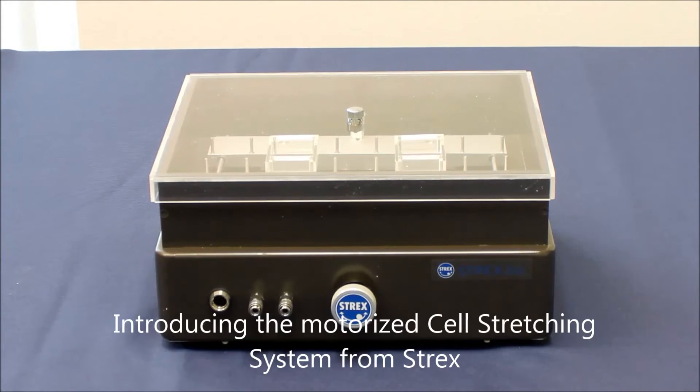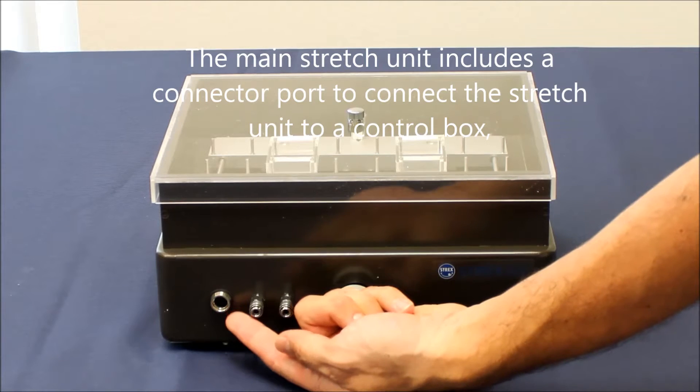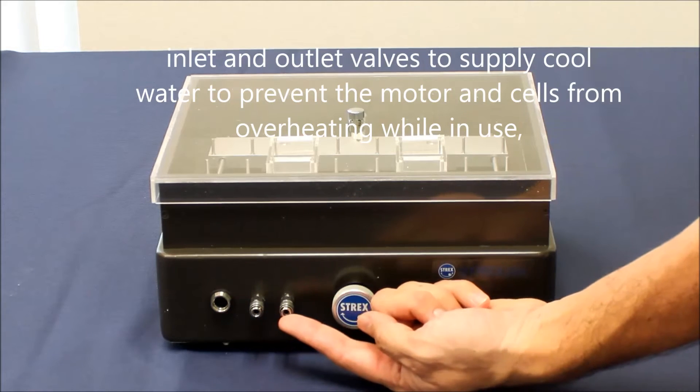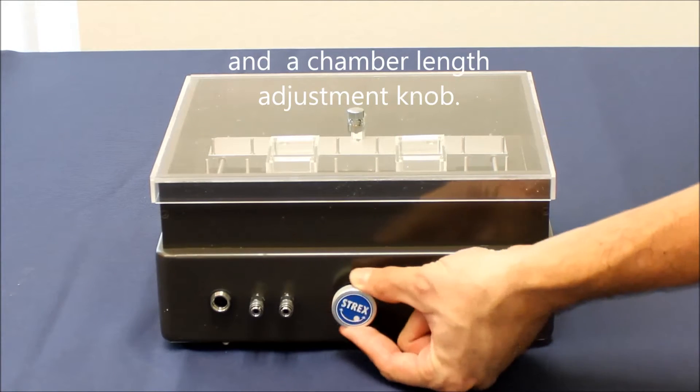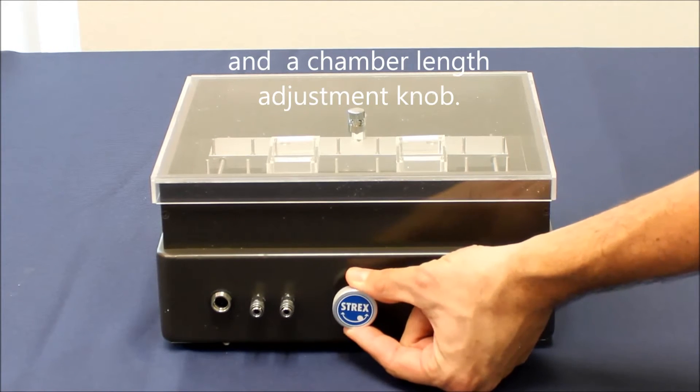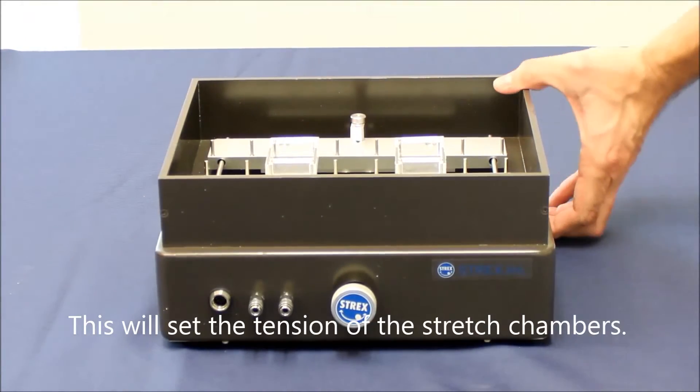Introducing the motorized cell stretching system from Strex. The main stretch unit includes a connector port to connect the stretch unit to a control box, inlet and outlet valves to supply cool water to prevent the motor and cells from overheating while in use, and a chamber length adjustment knob. This will set the tension of the stretch chambers.